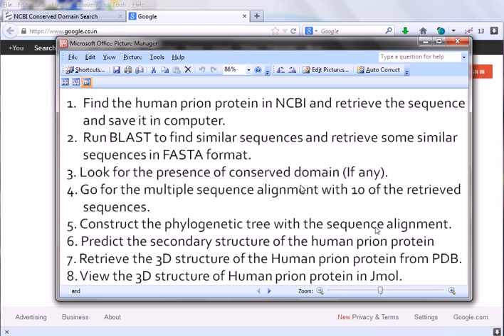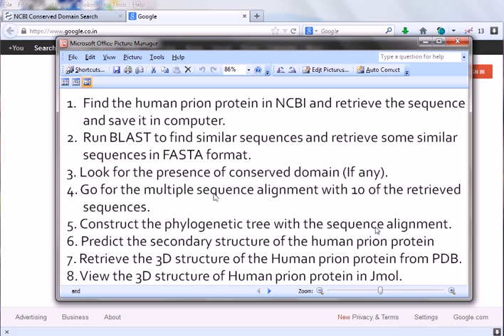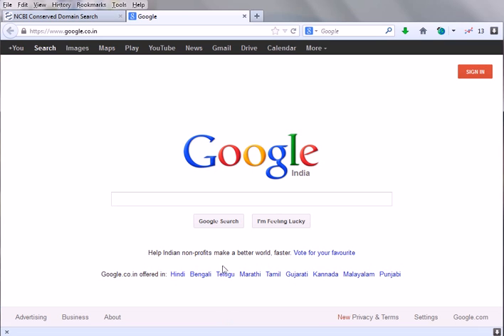Let's look at the fourth question, which is to go for the multiple sequence alignment of the 10 sequences that we just retrieved from the database earlier. So we will go for this MSA or multiple sequence alignment. This is very important because for any type of study to construct a phylogenetic tree or any different things using protein or molecular molecules.